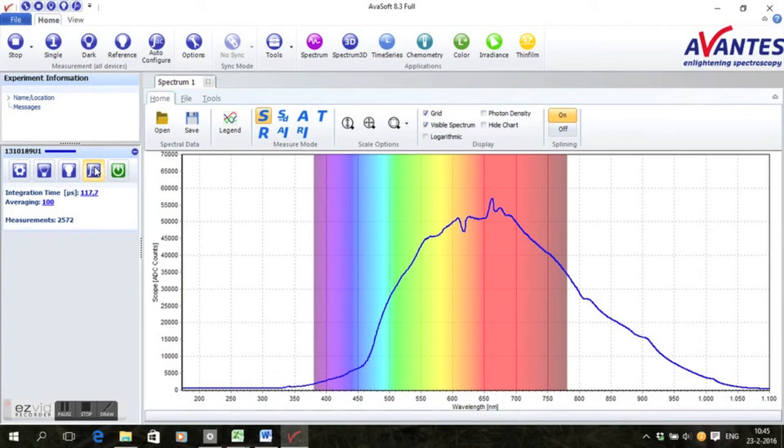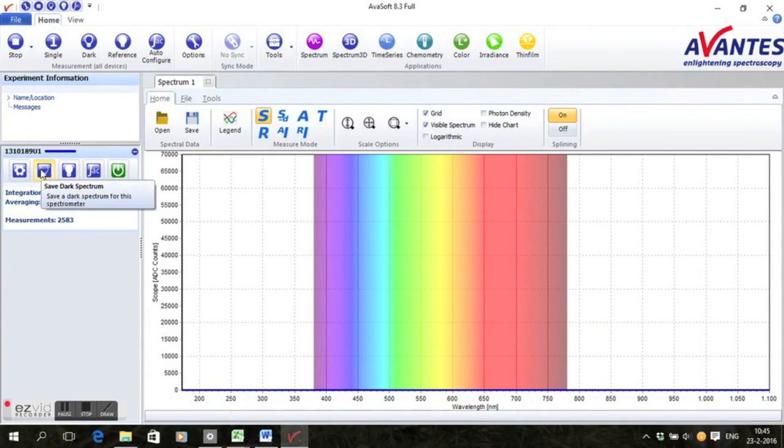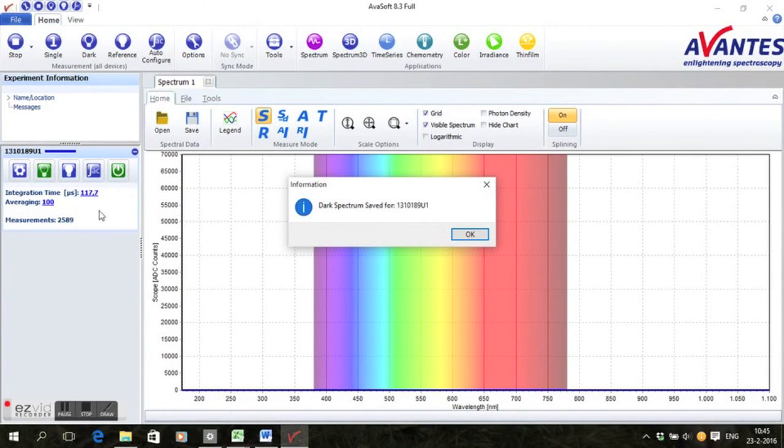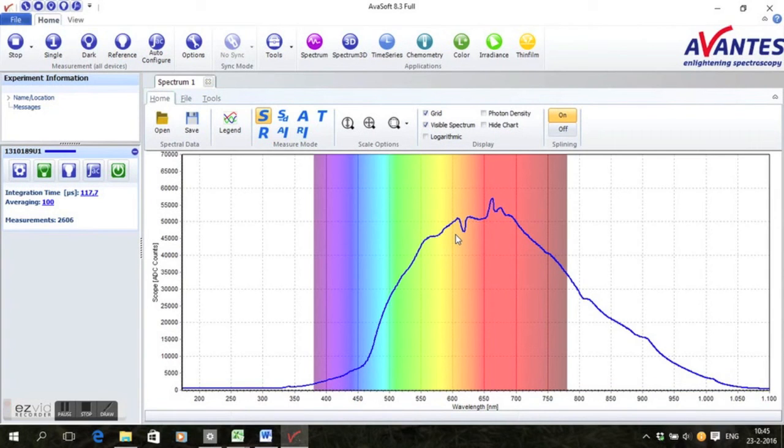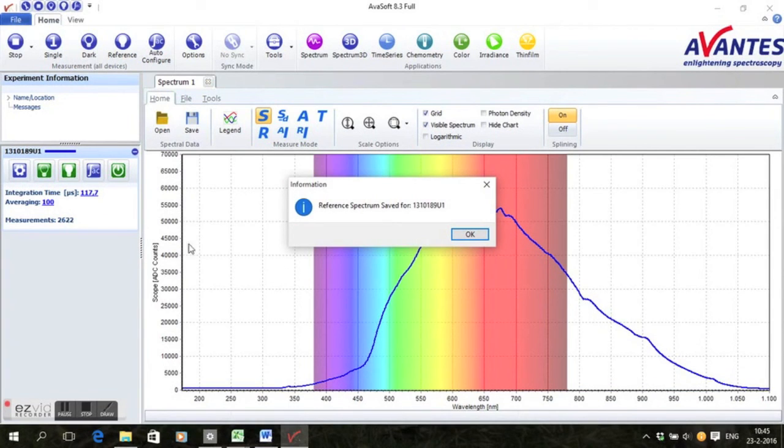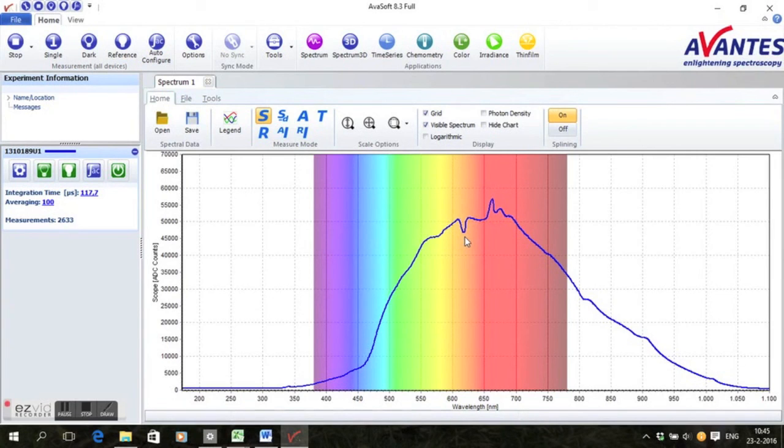Optimize your spectrometer settings. Switch off the light source and take a dark. Switch on the light source and take a white reference. Switch to relative irradiance mode.